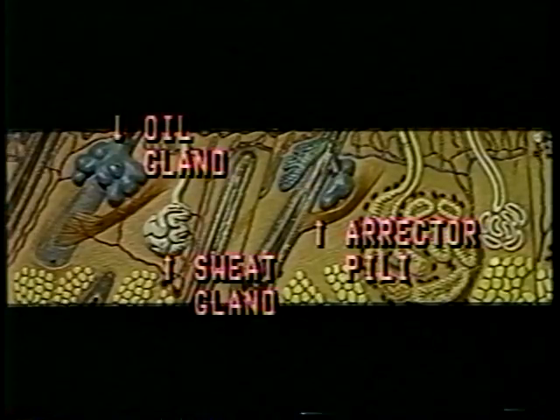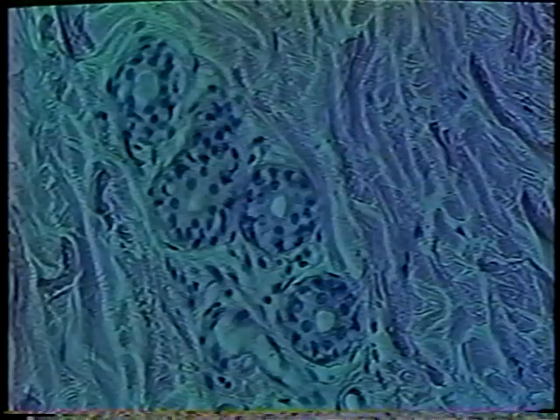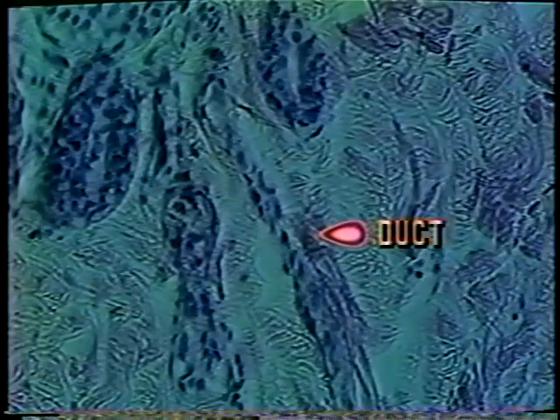This model of the skin shows you how these structures of the skin appear three-dimensionally. Notice that the sweat glands appear as a long coiled tube. When one makes a cross-section of this coiled tube, it appears as a series of round donut-shaped structures as seen in this high-power magnification of a sweat gland. Sometimes one may see a duct to the surface of the skin, as in this slide.